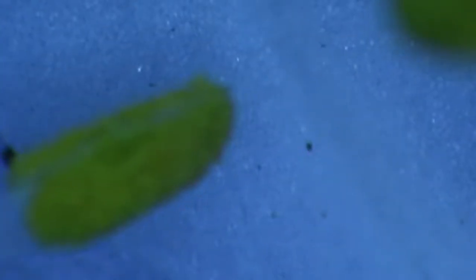Go to the bottom side, see if it's any different. Yeah, not too much going on there. But the flower is very nice. Let's go to the anthers here where the pollen is. Those of you that get allergic, you might start sneezing just looking at this. Very crumbly looking. This one's kind of broken open here. You can kind of see inside of it. That's pretty cool.